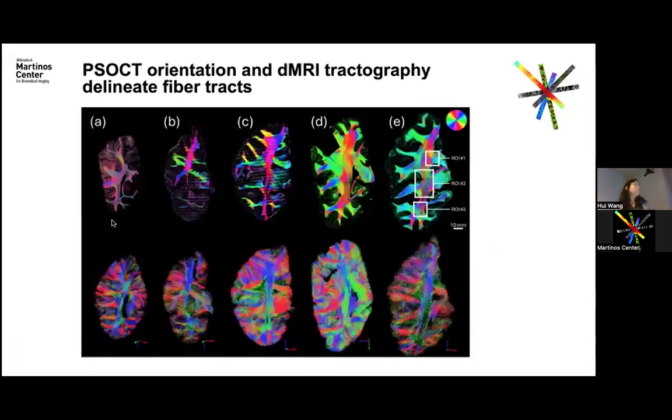We also show the fiber orientation image of those 5 samples. We were interested to know whether this low myelination can still preserve the fiber orientation information in very young brains.